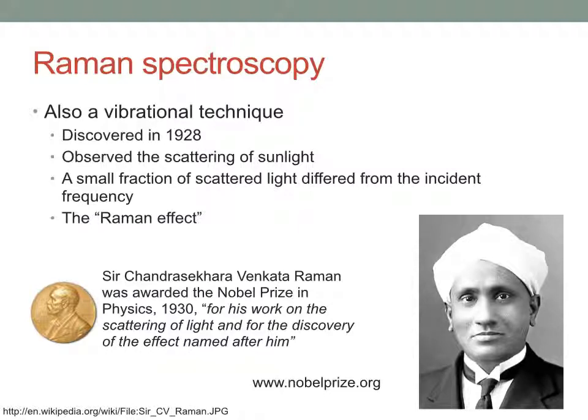The other spectroscopy that I was going to talk about today is Raman. The two go hand in hand in that they both look principally at vibrational energy levels within molecules. Raman can also be used to look at any other energy level within a molecule. Rotational is quite common from a theoretical point of view, but tends to be used less nowadays. Most Raman that we see is vibrational Raman.